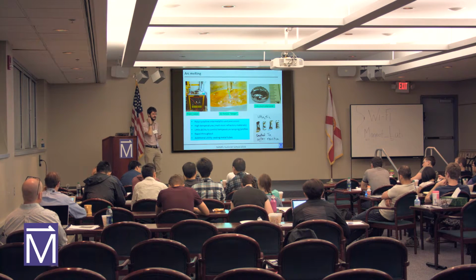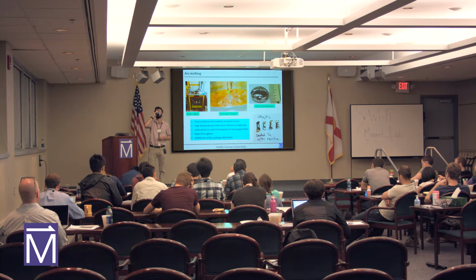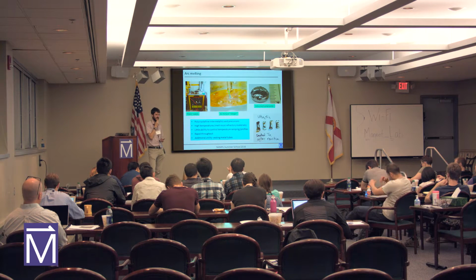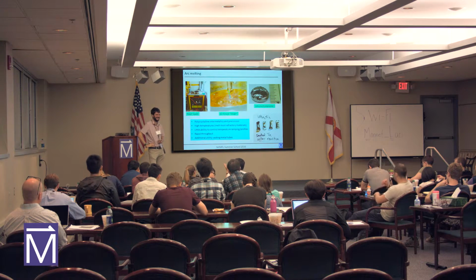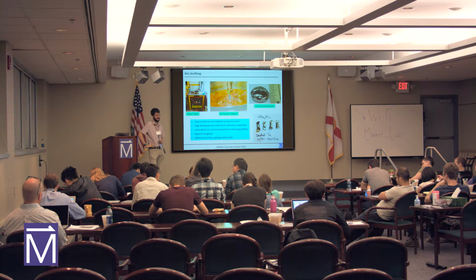So when you do this kind of arc melting process, oftentimes, if you want to do a really homogeneous reaction, you want to flip the button and remelt it. That's right. And sometimes if you have a low thermal conductor, it just explodes. Yes. You lose your mass. Yes. And go over and start over. Yeah. That's what I don't want to do. So how do you decide all that, like when you stop?